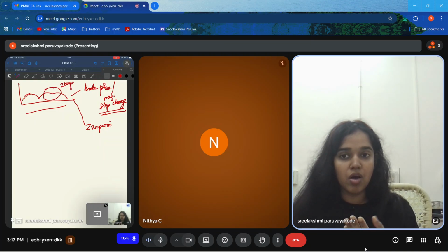So this is how, by fitting the data using passive elements, we get to know how many circuits there are, how many RC elements there are, and based on that we can get a good fit. And by validating the error, we'll know whether the additional added elements are required or not.